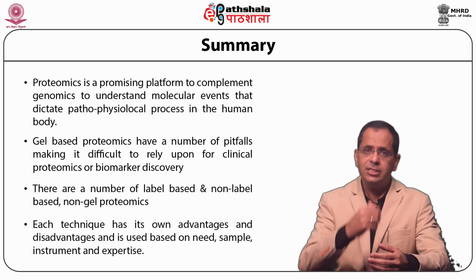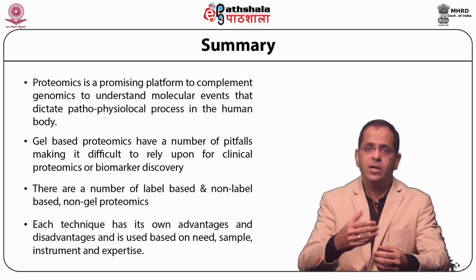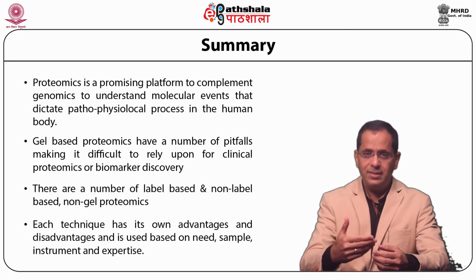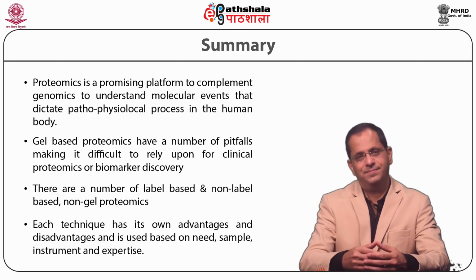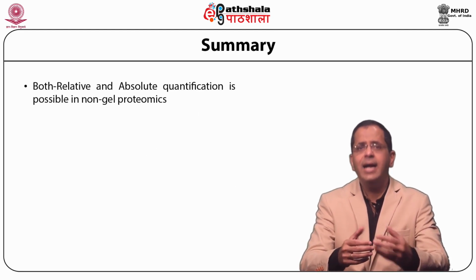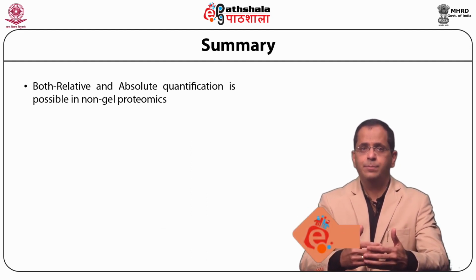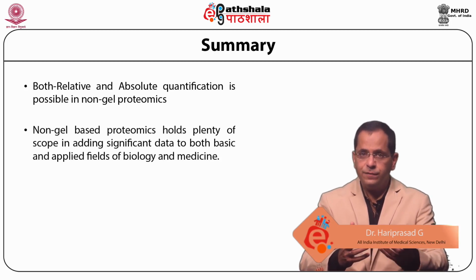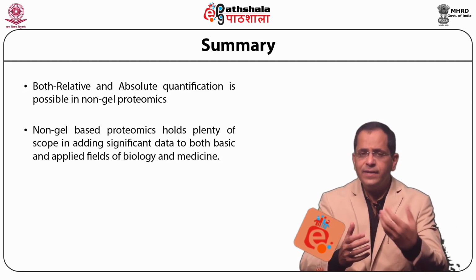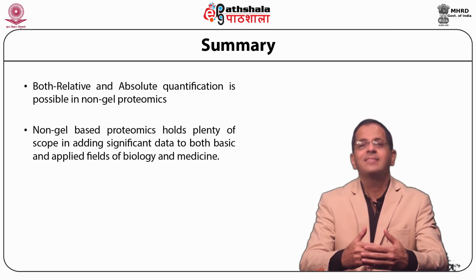Each technique has its own advantages and disadvantages and is used based on the need, the sample size, the instrument, and the expertise available. Both relative and absolute quantification is possible using non-gel based proteomics. Non-gel based proteomics holds plenty of scope in adding significant data to both basic as well as applied fields of biology and medicine. Thank you so much.